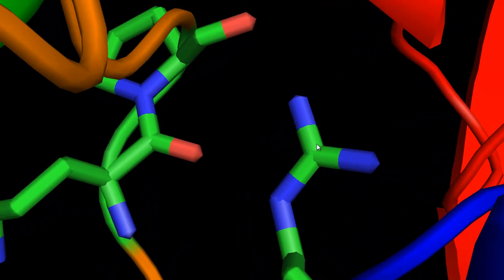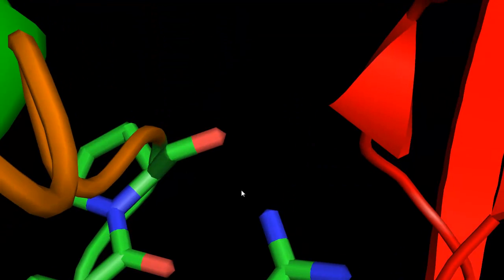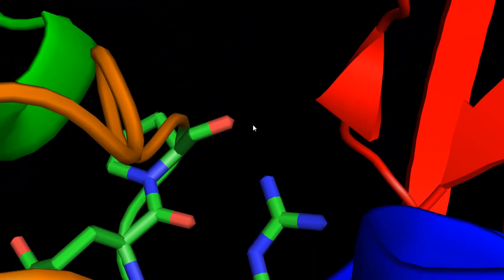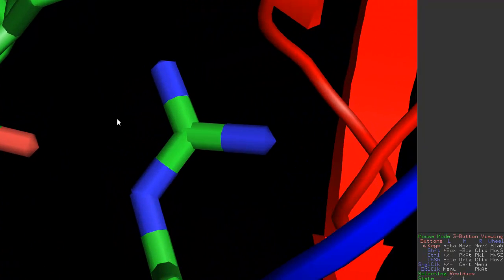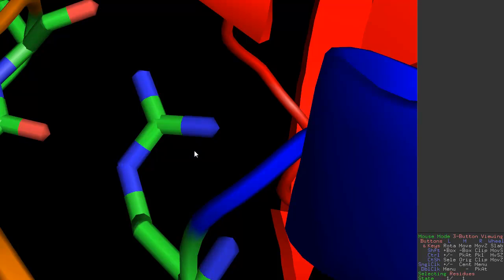Okay, so what we can do is mutate this residue, for example, into an acidic amino acid. Acidic amino acid will have a negative charge, the same charge as these oxygens. In that case, we'll actually abolish this favorable interaction for a non-favorable interaction. Because opposites attract, but if you have the same charge or the same type of environment, you're going to have repulsion instead. And that could definitely hinder the antibody recognition to the antigen.